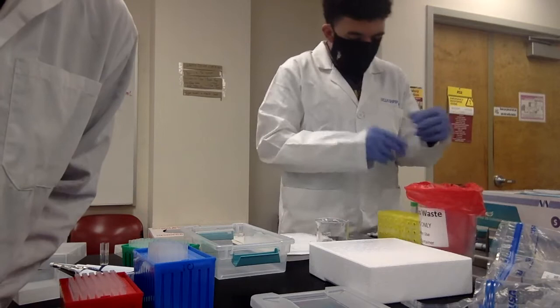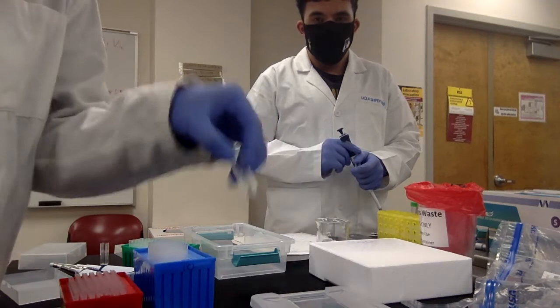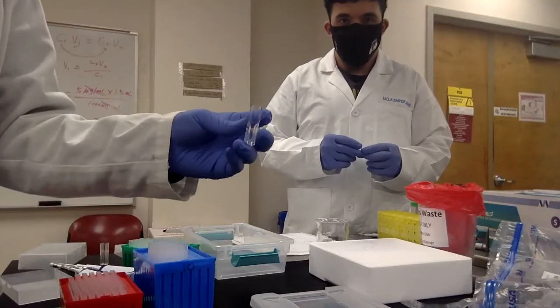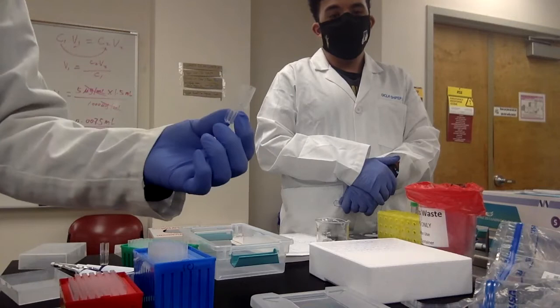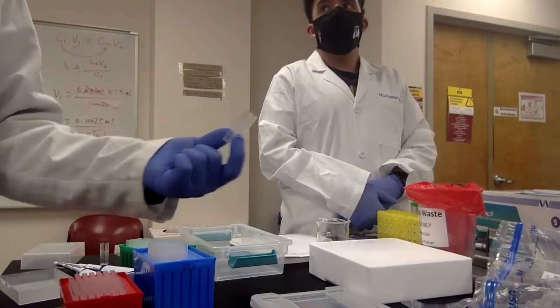That is a very good question: why are we not adding solutions directly into this? The answer is we are not mixing anything in this cuvette. This one is plastic or whatever material, so it's cheap. Sometimes when you do actual biochemical lab, the material is very expensive. For example, in my lab, we use silicon dioxide material, if I remember correctly. One cuvette is worth a couple hundred dollars. So it's very expensive.